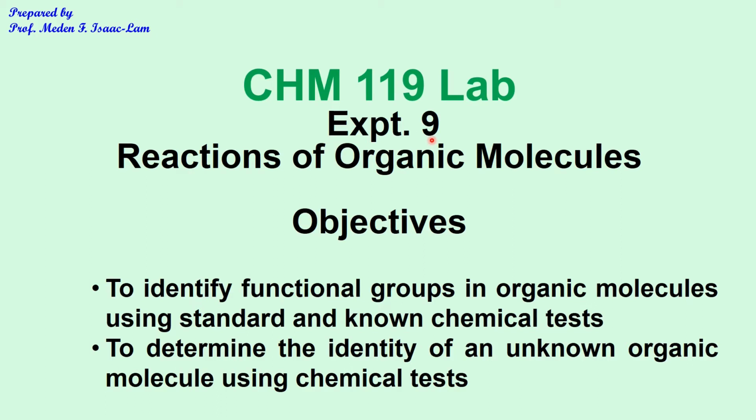Experiment 9 is about reactions of organic molecules. Objectives of the experiment are to identify functional groups in organic molecules using standard and known chemical tests, and to determine the identity of an unknown organic molecule using chemical tests.